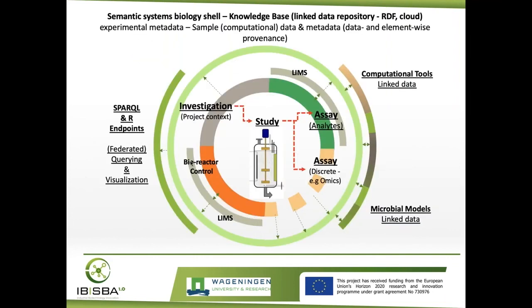It's important also that for this purpose, and also to make sure that all of the many types of data generated can be stored, can be managed, can be useful for further development, it's important to have in place solid laboratory management systems, so that all the information can be analyzed, deposited and managed in a FAIR way.